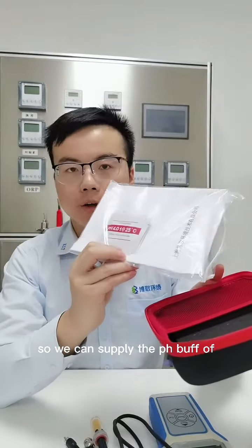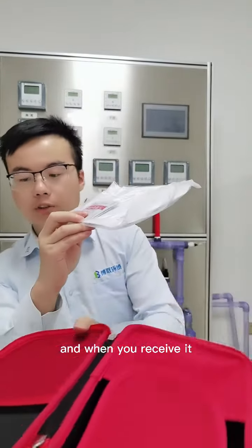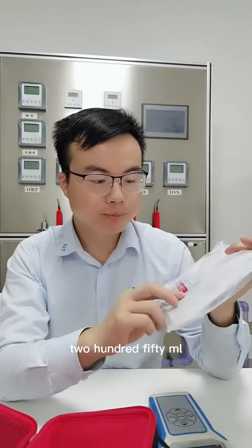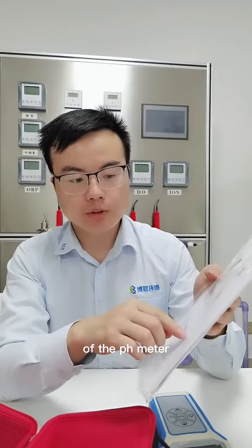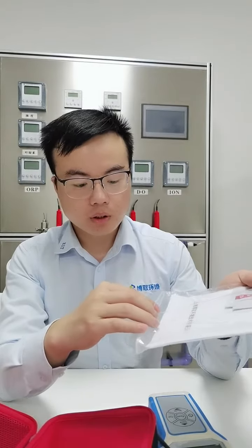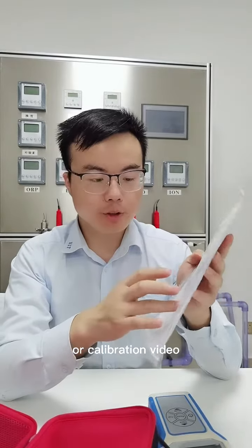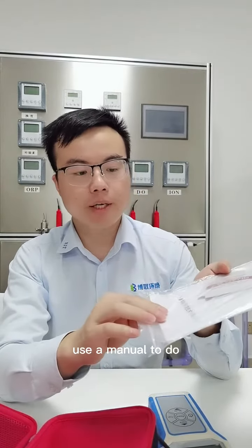We can supply you the pH buffer in powder form. When you receive it, you need to do calibration — just dissolve it in 250 ml of water. Also included is the user manual for the pH meter. In addition to the user manual, we supply an operation and calibration video so you can refer to it for any operations of the pH meter.